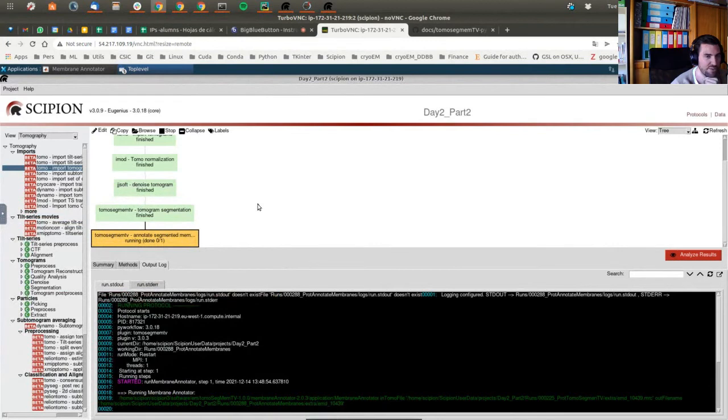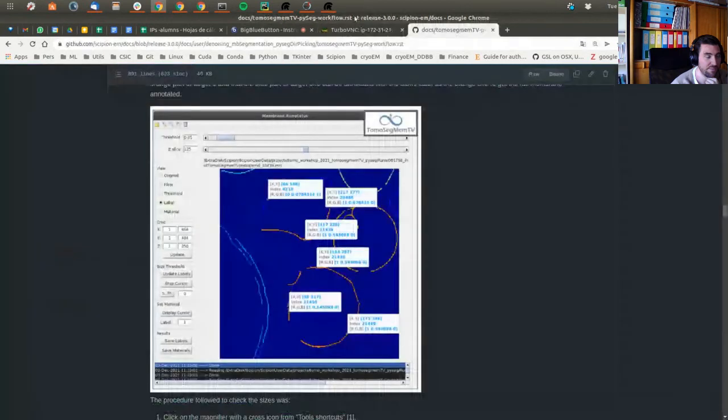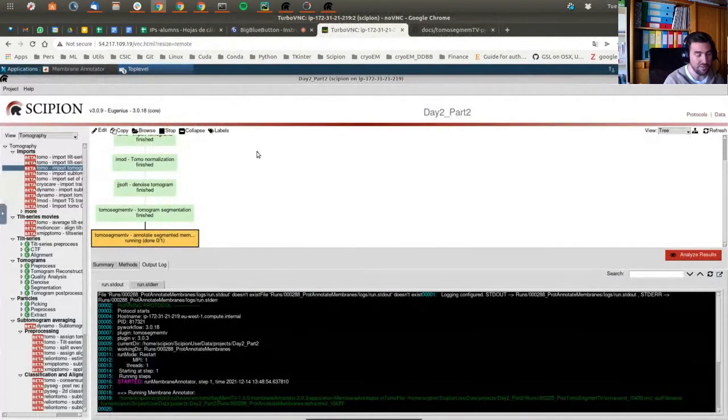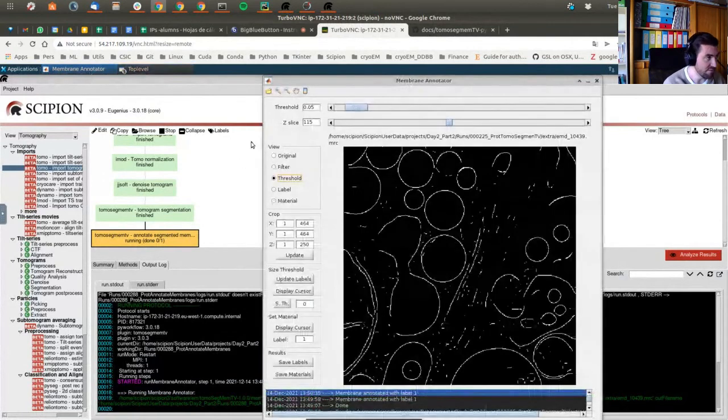So far so good? Yes, we are following. Okay. So I'm going to annotate the second and the third vesicles, and the procedure is the same. So let's try to do them together. And if you get lost, we have a little time to have all of this ready.